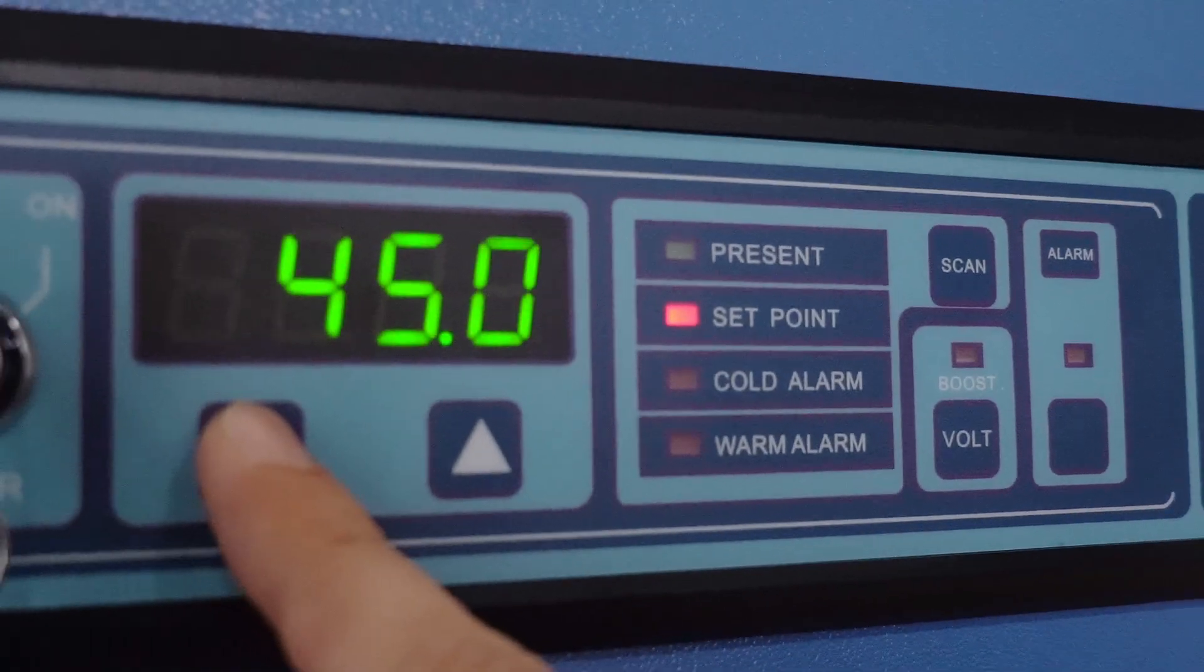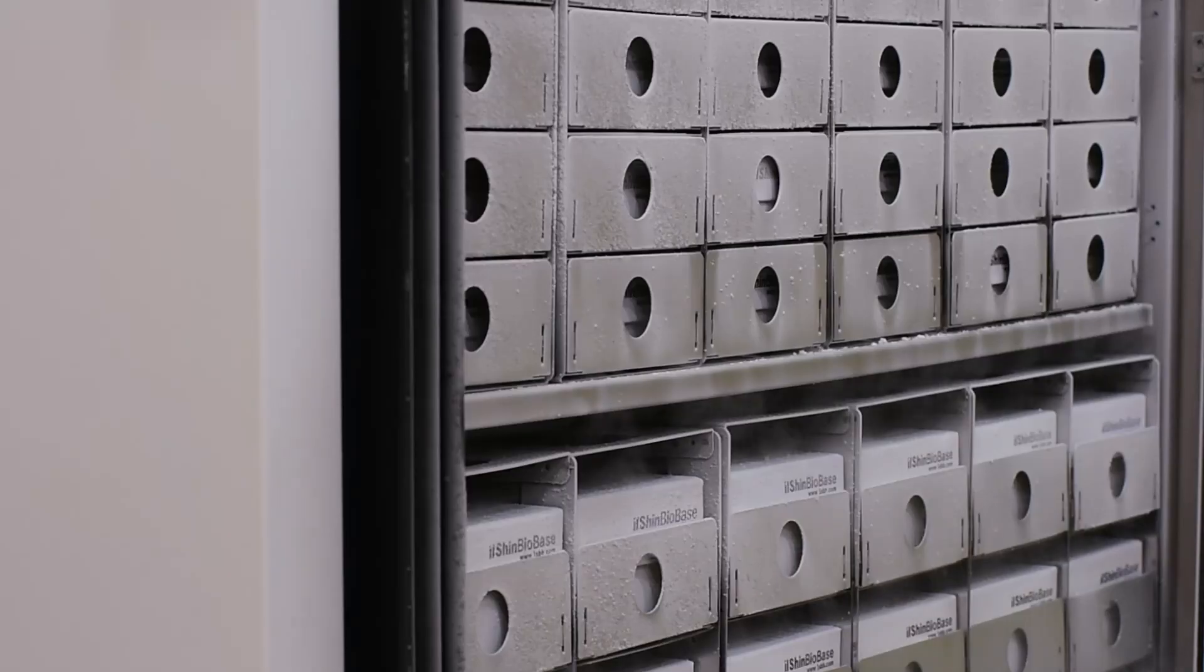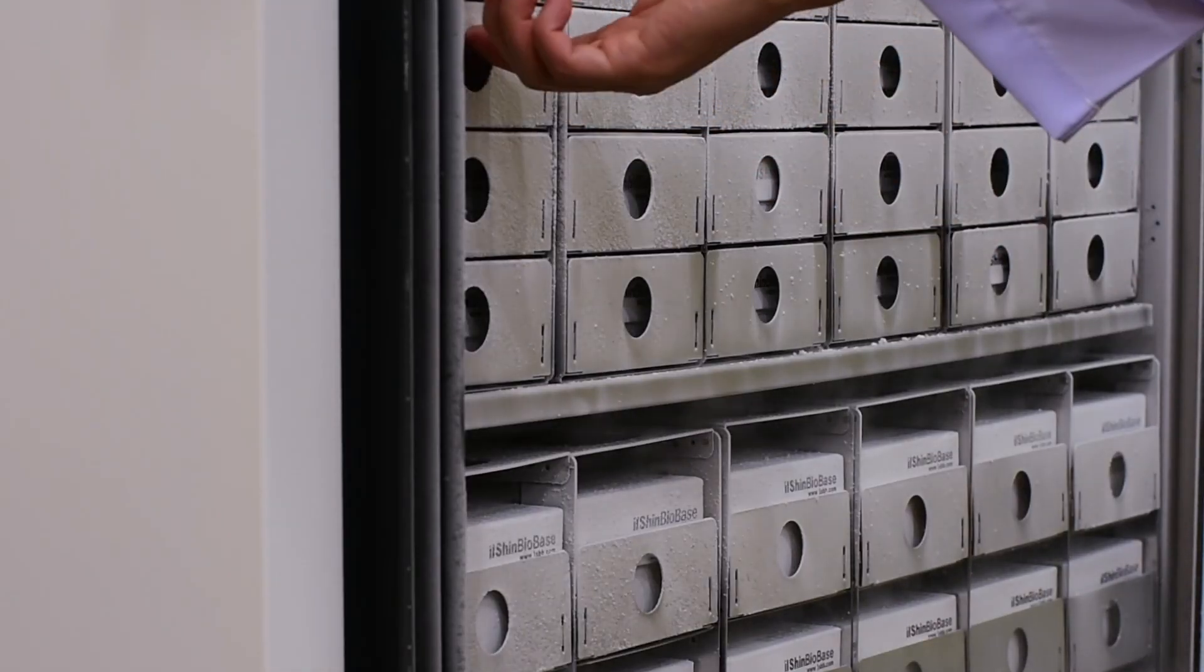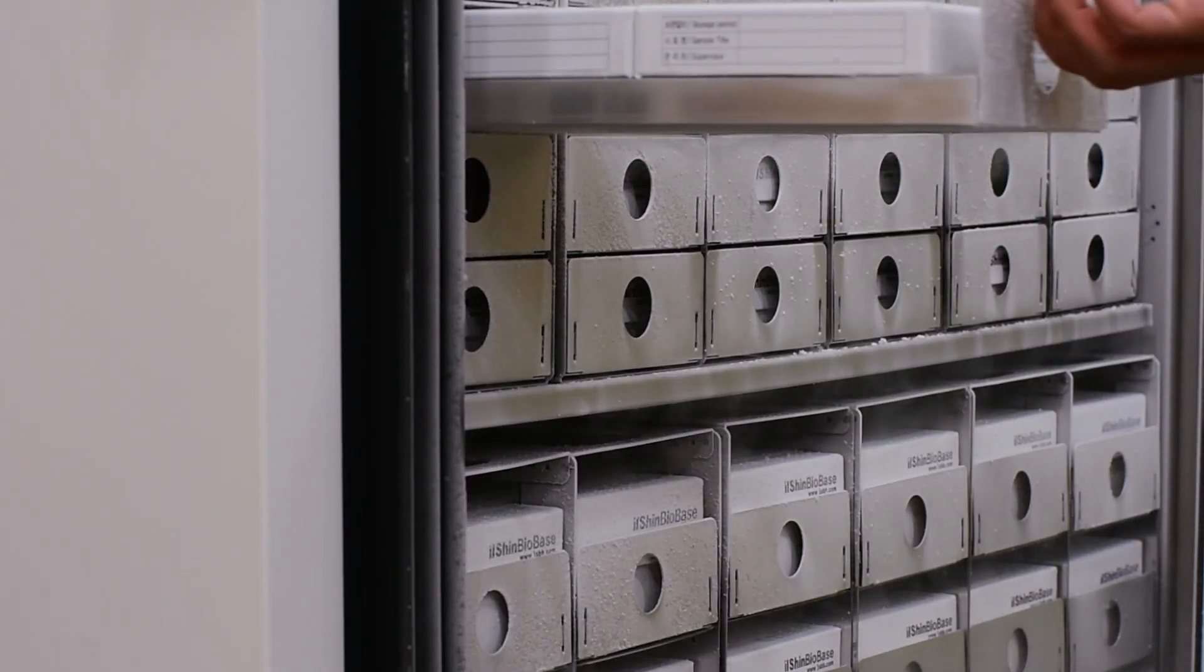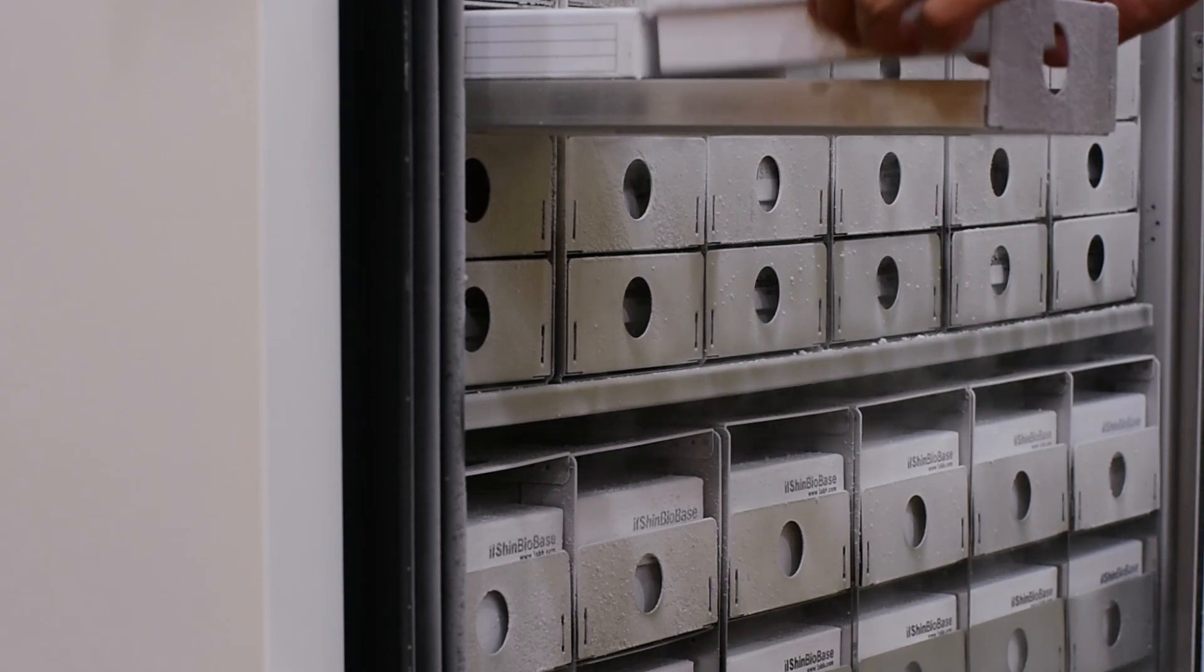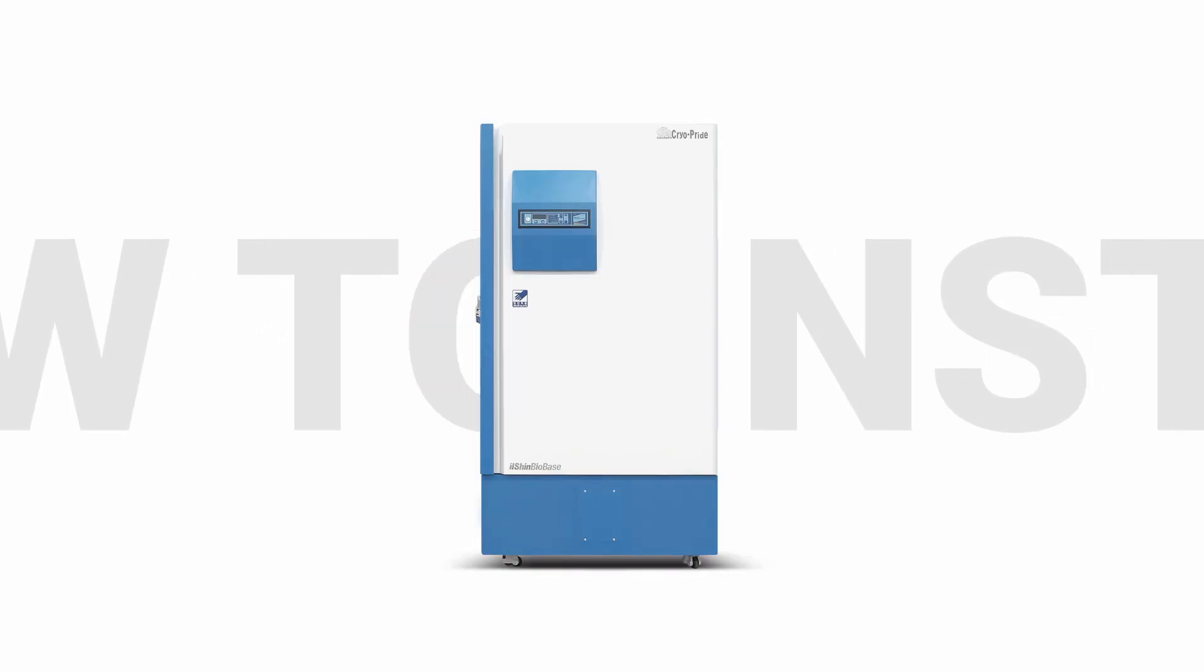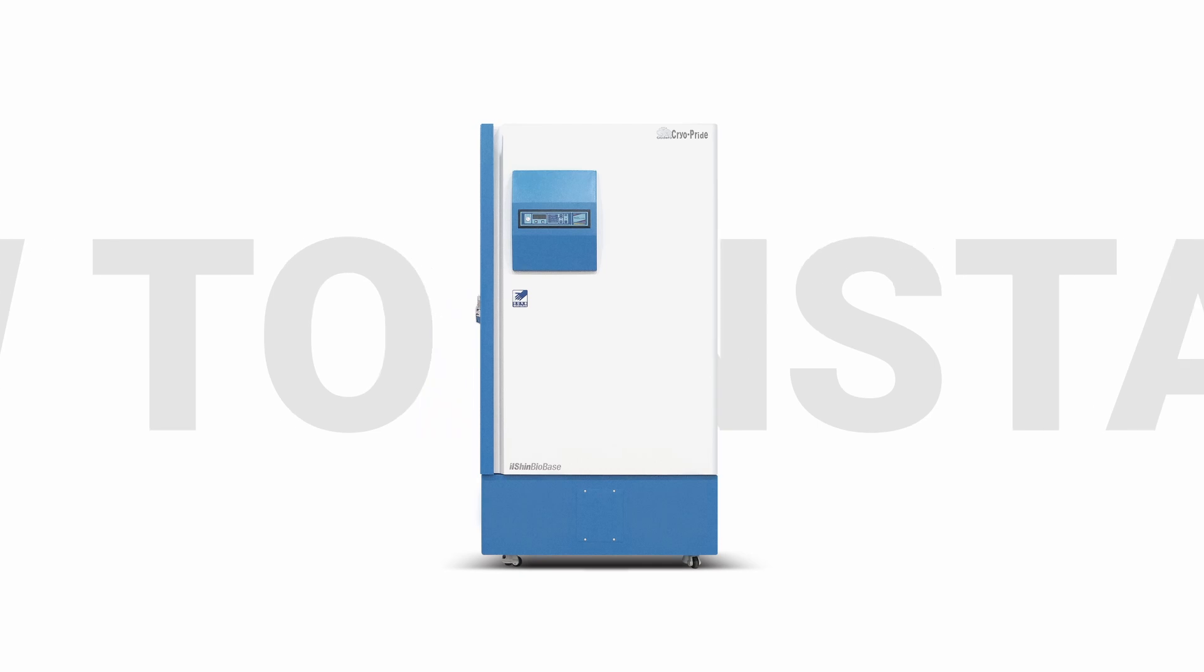With LED controller, automatic vacuum release system, GP-Series shall be optimal solution for long-term storage at ultra-low temperature. Now we will show you how to install and operate GP-Series ULT Freezer.